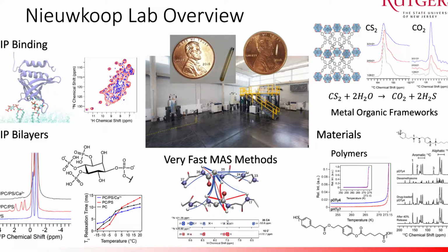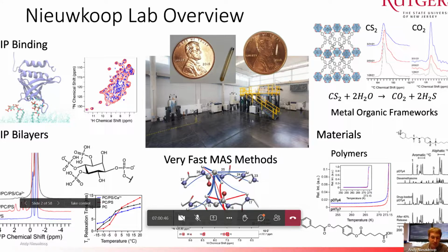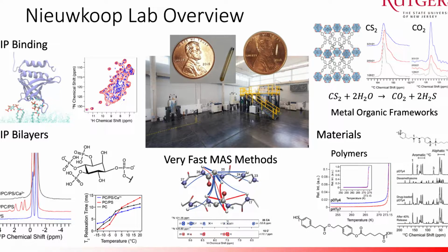As you heard from my CV, I've spent a lot of time in my life as a bio solid-state NMR spectroscopist, so a squishy-state NMR spectroscopist. But having arrived here at Rutgers and started my lab, there's a lot of really cool materials, inorganic chemistry type things happening on campus. So as I've reached out to colleagues, and to be honest, as my students have reached out to their fellow students, we've actually developed a couple of pretty cool projects working on much more traditional, quote unquote, solid-state NMR. And so I'll share with you some results at the end that we've gotten on those projects as well.